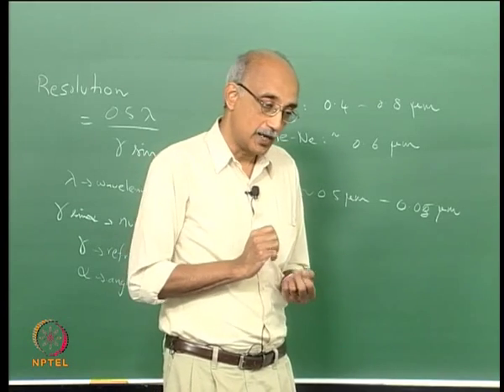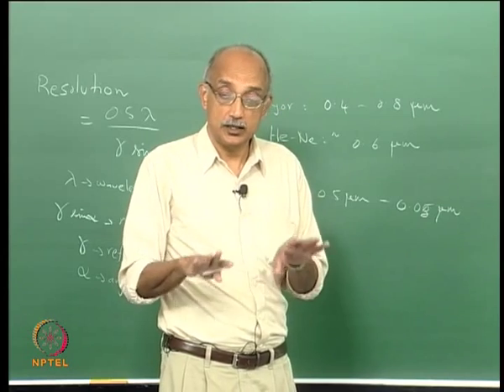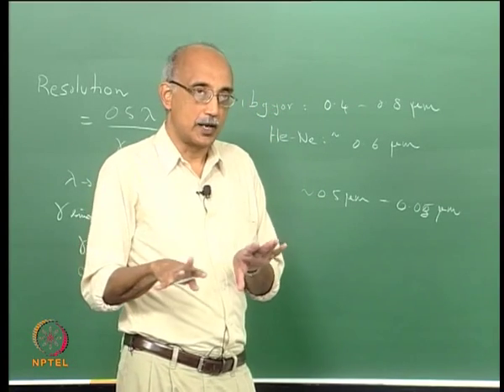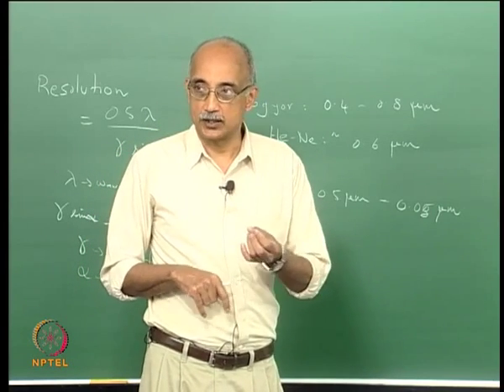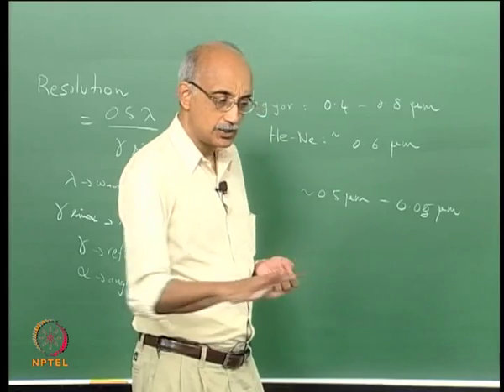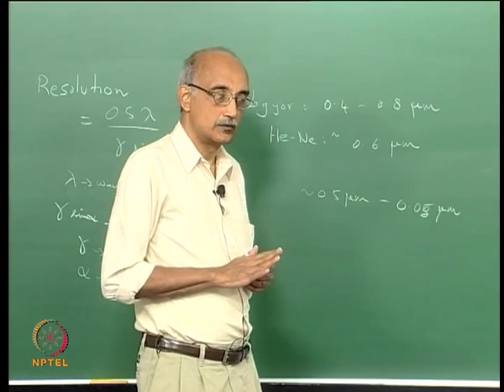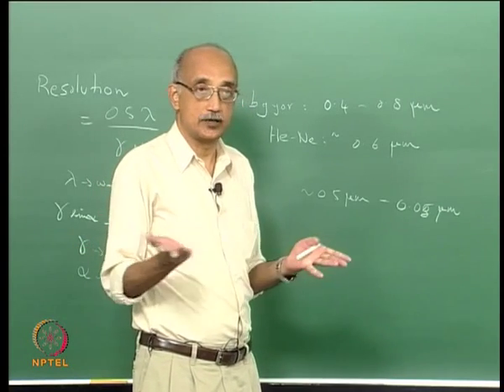However, you can imagine that, for example, if your surface is very rough, that the interference that you get from the surface is going to be of the same order of magnitude as the particle or defect that you are trying to analyze. So, this type of continuous scanning methodology works very well when you have highly polished and smooth surfaces. For example, silicon wafers.